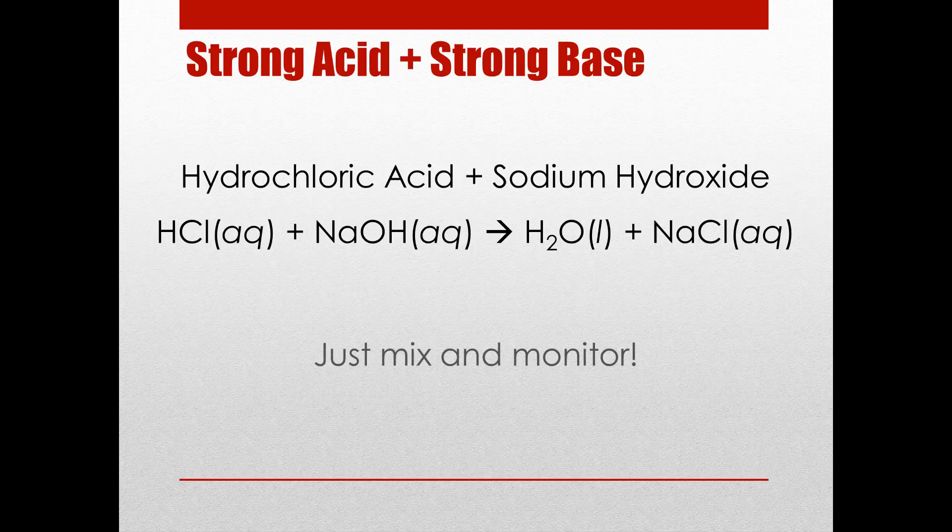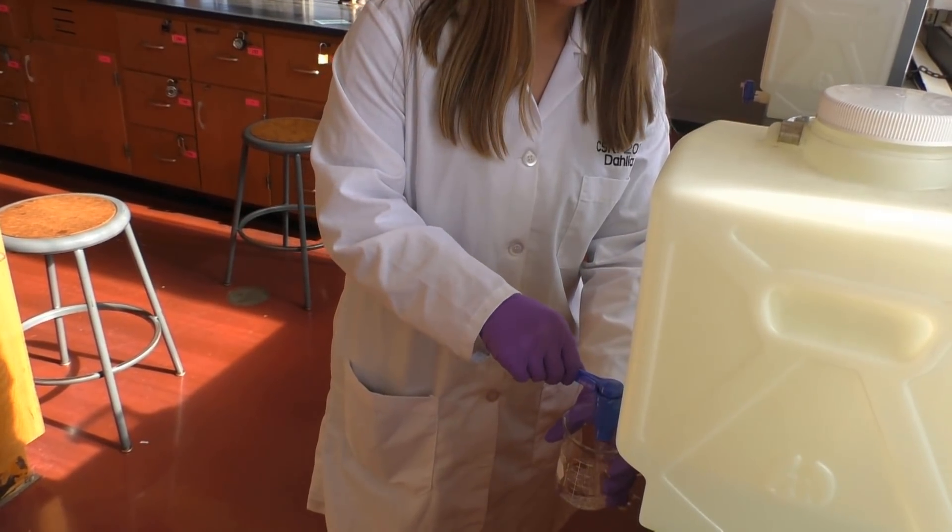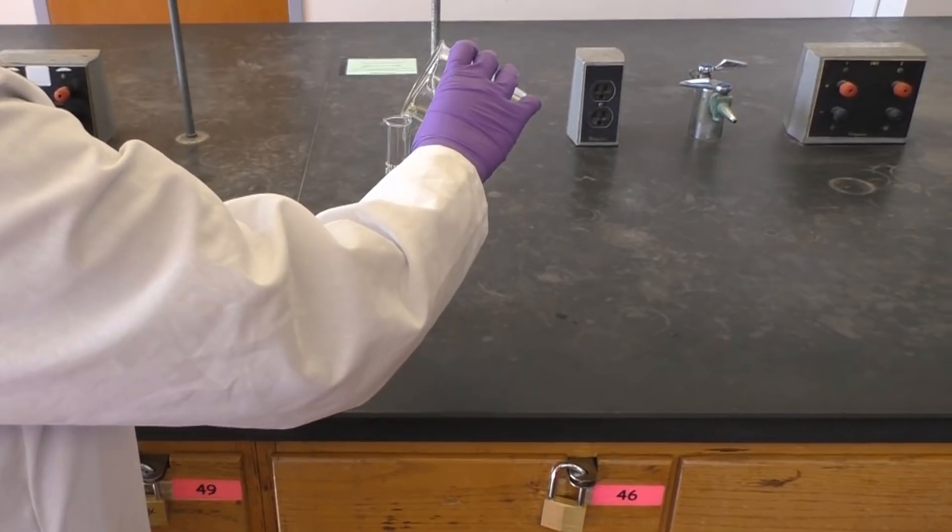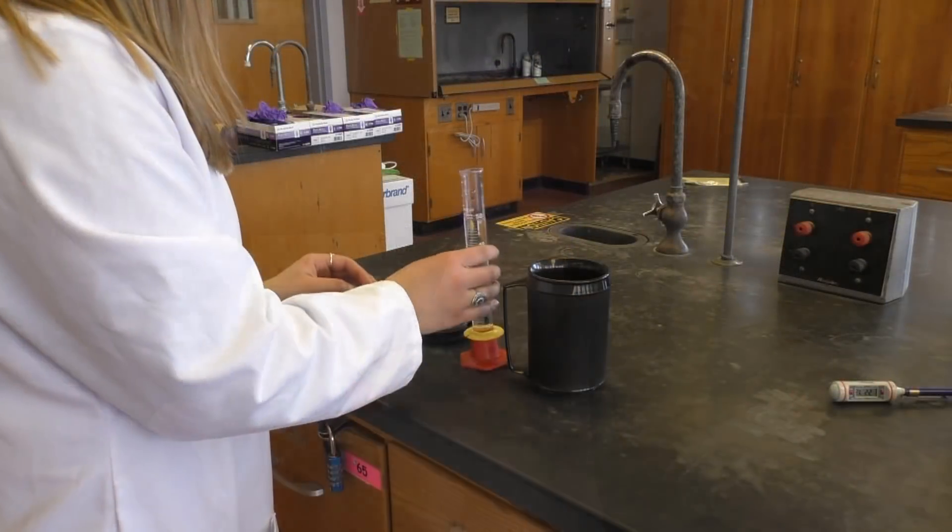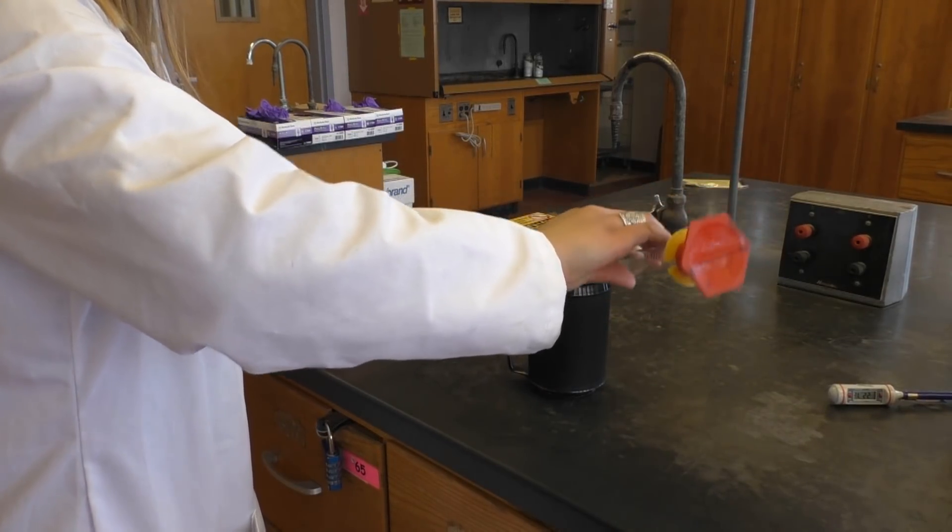To measure the heat of this reaction, all you need to do is mix the two solutions in your calorimeter and monitor their heat by taking the temperature. You first need to obtain 50 mL of NaOH. Don't measure from the carboy directly because this will hold up the line behind you. Instead, just add approximately 50 mL to your beaker and then carefully measure out the correct amount in your graduated cylinder. Then just add your NaOH to your calorimeter.